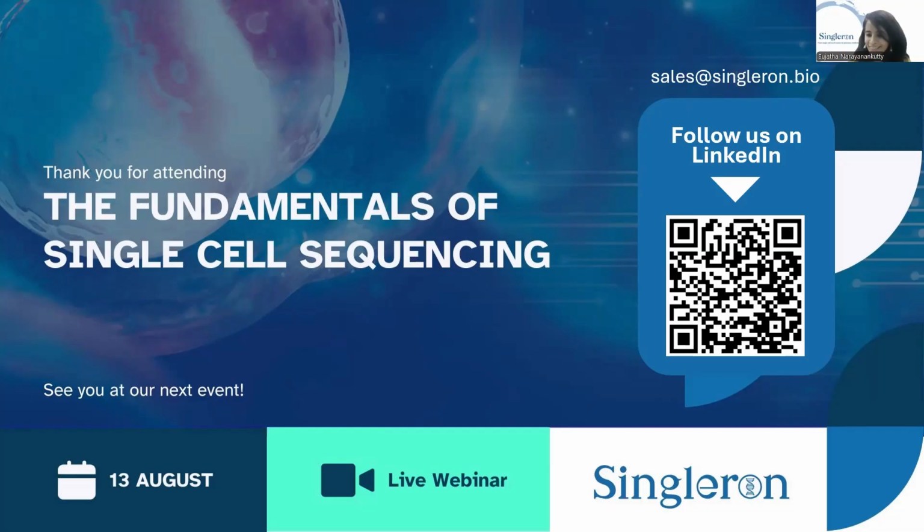The second part of the question is how to avoid noise disturbance during analysis. In terms of analysis, there are a few areas from which noise can come in your data. One could be doublets or multiplets, or some kind of ambient signal coming in.